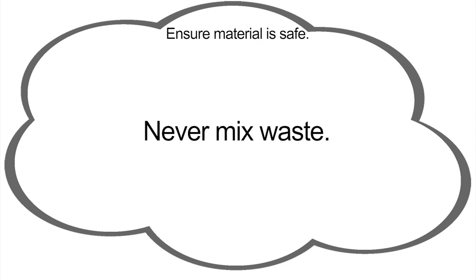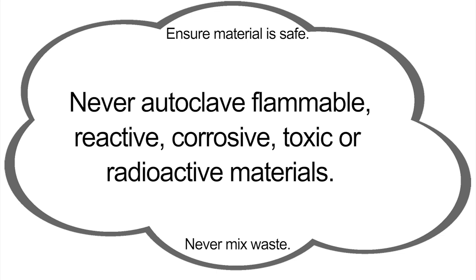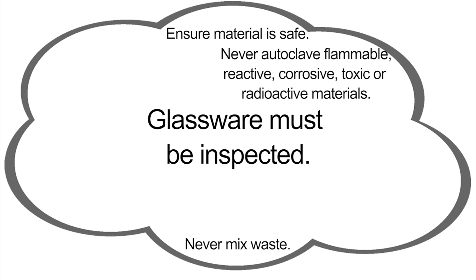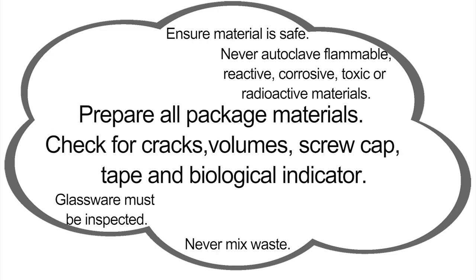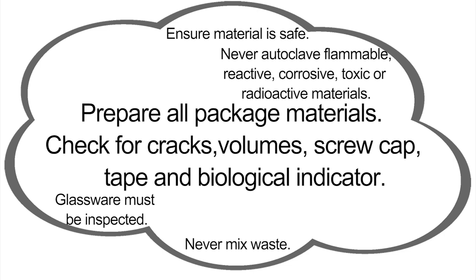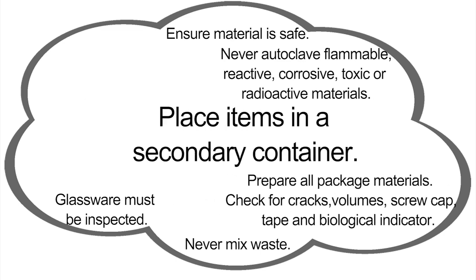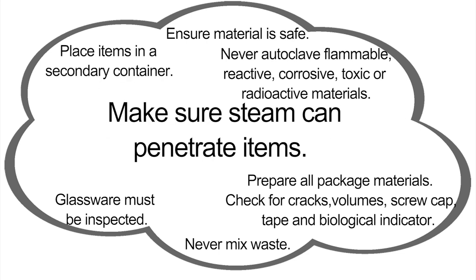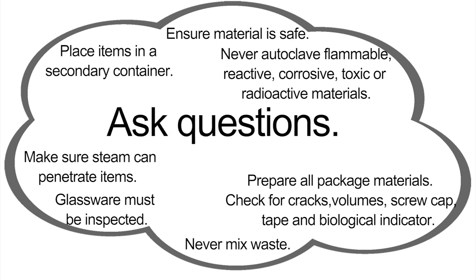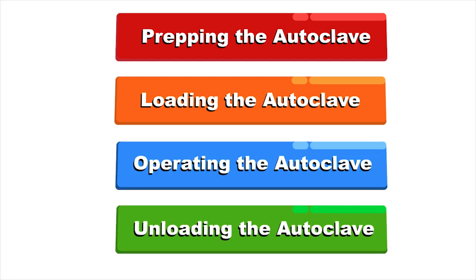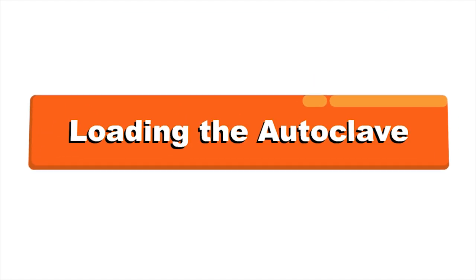To summarize preparing for autoclave use: ensure material is safe for autoclaving. Never mix waste and never autoclave flammable, reactive, corrosive, toxic, or radioactive materials. Glassware must be inspected for cracks prior to autoclaving. Prepare all packaged materials suitably. Check for cracks, double check volumes, and screw cap security, placement of autoclave tape, and/or BI. Place items in an autoclave rated secondary container to secure and contain spills and for ease of removal. Make sure steam can penetrate items for proper sterilization. Be sure to ask questions. Communication is key.